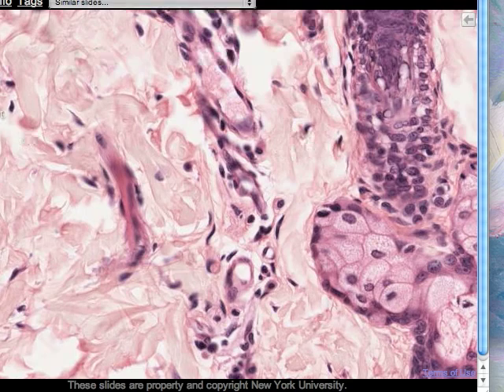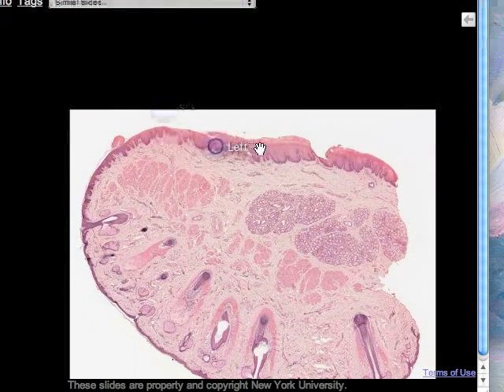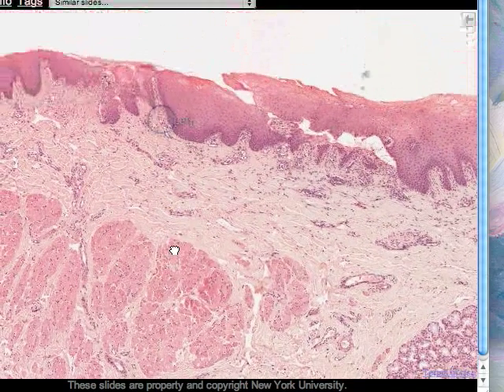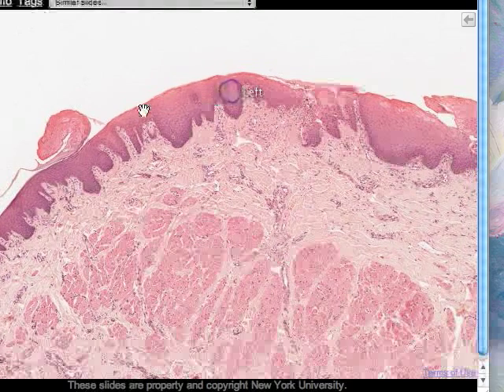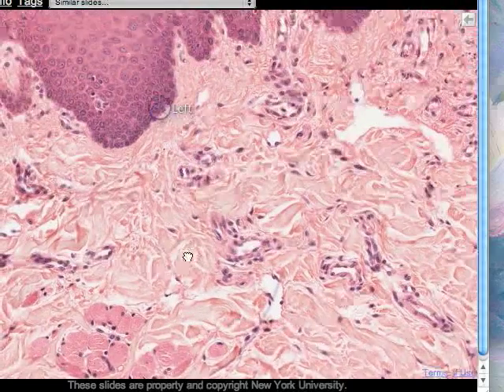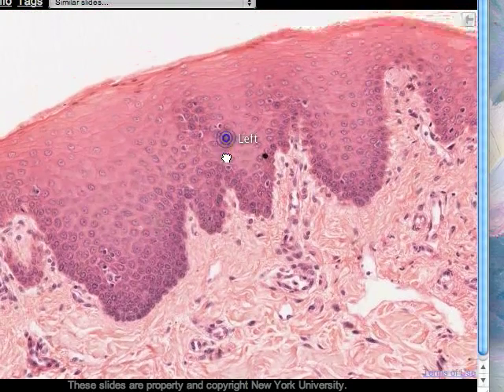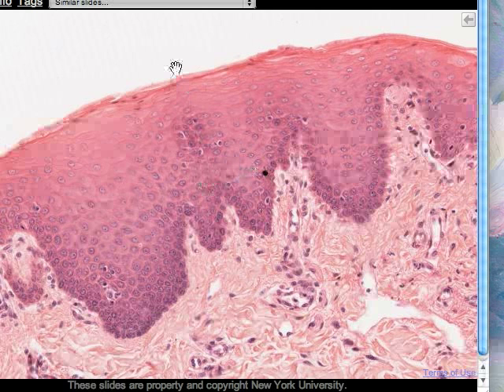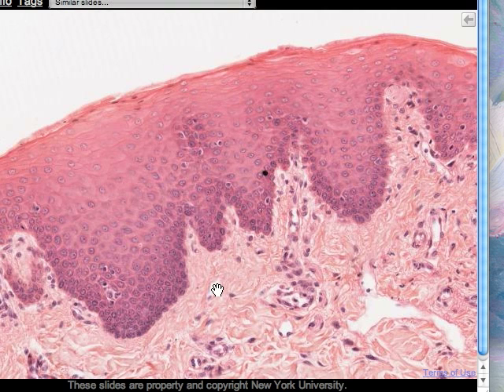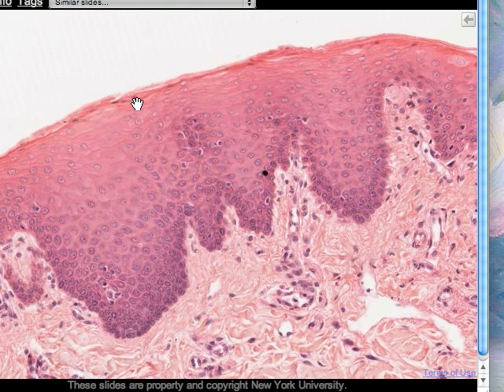Now we move to the other side of the specimen and look at the stratified squamous non-keratinised epithelium on this surface. This is the surface of the mucous membrane — the inside of the lip. It is a moist surface. The basement membrane is somewhere along here but we can't see it because it doesn't stain. You can tell this is non-keratinised because cell nuclei are visible out at the outermost layers. Keratinization involves the death of cells and the loss of their nuclei and other organelles.